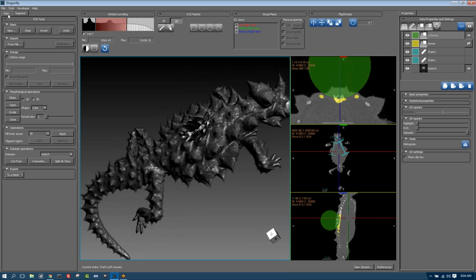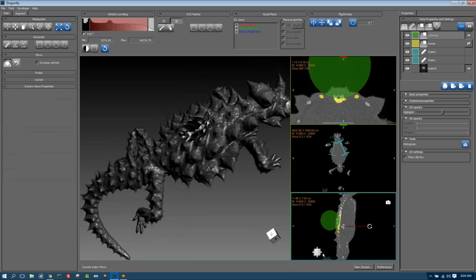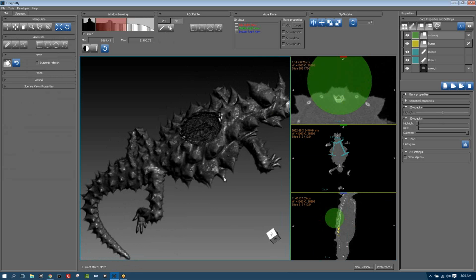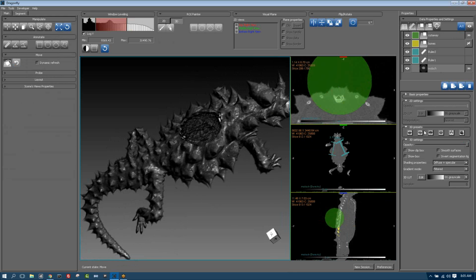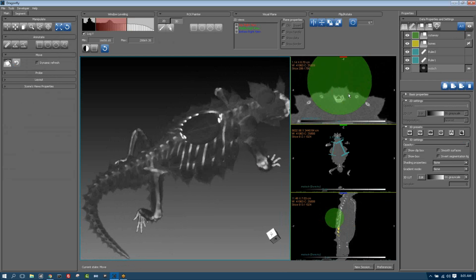I should mention also that one of the panels we haven't looked at yet is a panel called Move, and this allows you to modulate whatever is selected. So if this ROI, this region of interest, happens to be selected, then I can translate this, and now I have my 3D rendering looking somewhere else. I have my cutaway modulating another region in the data set. So that gives you a powerful way of using the segmentations, not just for labeling pixels, but for creating novel 3D presentations of the data.